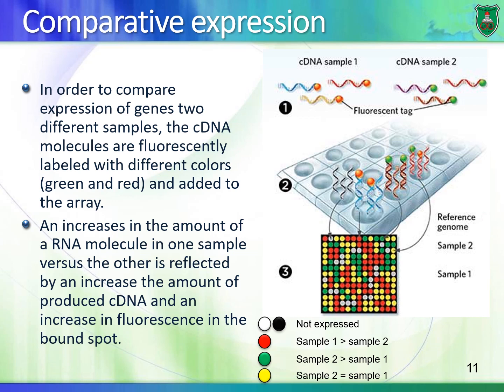These two samples can be control versus cancer. You should always have a control with cells: control cells versus cells exposed to a certain drug, whatever that drug is, and so on. Control cells versus cells exposed to a certain toxin. And you want to see changes in gene expression as a result of exposure of cells to a certain drug.